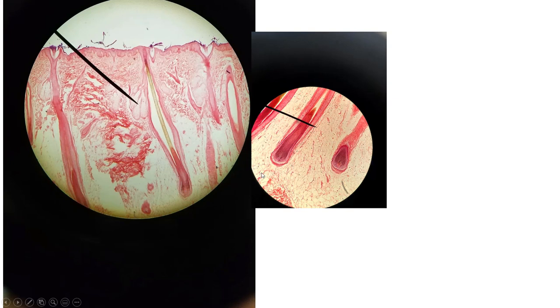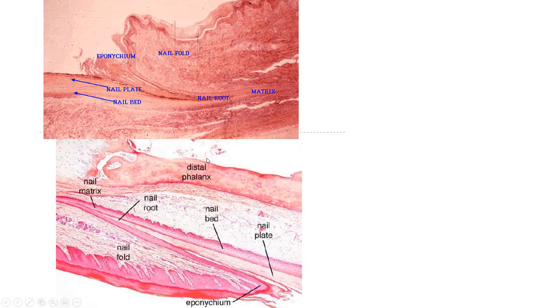Looking at a microscope slide of hair — you see the hair follicle here, and when you look closely you can actually see the papilla of the hair. The matrix would be right here with dividing cells pushing out other structures. If you look closely you also see some sebaceous glands right here, which secrete oil into the hair follicle.